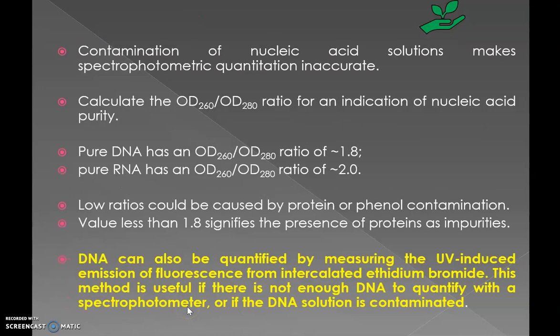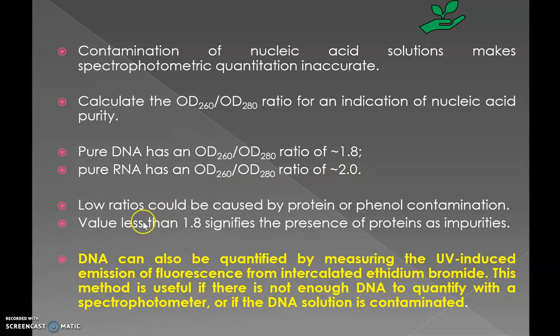Contamination of nucleic acid solutions makes spectrophotometric quantitation inaccurate. For checking the purity, we must calculate the OD260/280 ratio. Pure DNA has an OD260/280 ratio of around 1.8, while pure RNA has an OD260/280 ratio of 2.0. Low ratios could be caused by protein or phenol contamination. A value less than 1.8 signifies the presence of proteins as impurities.